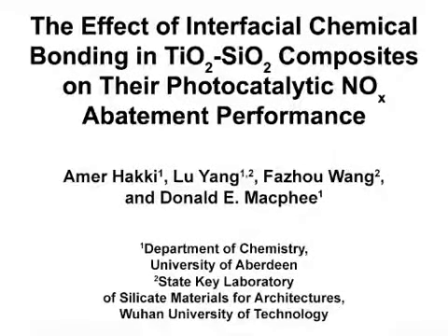The overall goal of this procedure is to quantitatively assess the benefits of supported photocatalysts in environmental applications and to understand the implications of chemical bonding between catalysts and their supports on deNOx aspects of air quality management. The greater accessible surface area offered by supported photocatalysts suggests a more efficient ability to reduce NOx concentrations in the atmosphere. However, little is known about the influence of the support on the catalyst performance and properties.